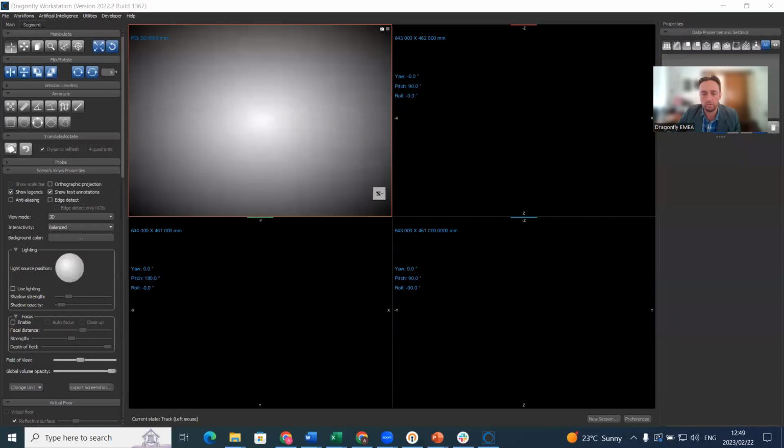So in this video, I'm going to show you how to make analysis. The first two videos were about manipulating and understanding the interface of Dragonfly, manipulating images. The second was on segmentation a little bit, basic segmentation tools. And now we will do not only segmentation, but take it to the next step for some analysis.